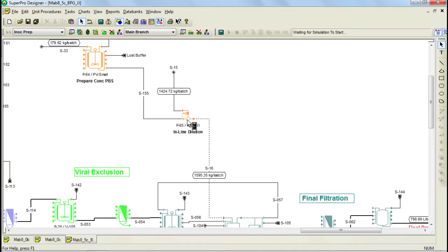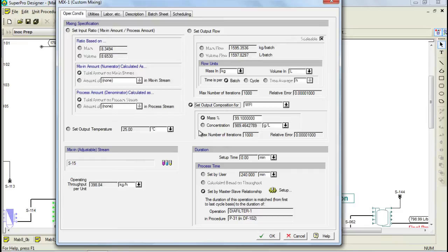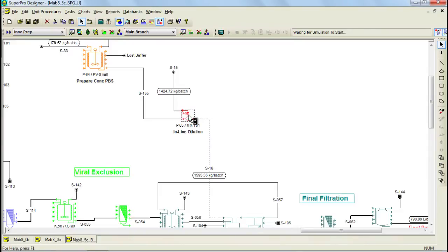Mixing specifications can be defined by the user through the mix operation by right-clicking on the unit procedure and selecting Operation Data. There are various options for the way the user can specify the mixing data, including input ratio, output flow, and output composition. In this case, the option to set output composition for WFI was chosen. Through this option, the final mass percentage or concentration can be specified. The final composition is then achieved by mixing the concentrated buffer and the diluent. Furthermore, SuperPro Designer can calculate the amount of required materials by backpropagating the information specified in this unit procedure.